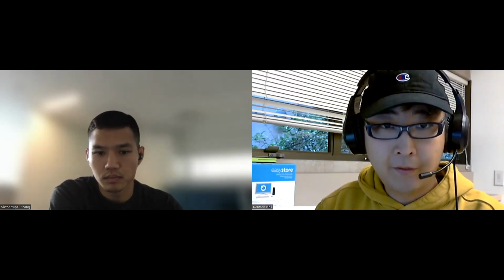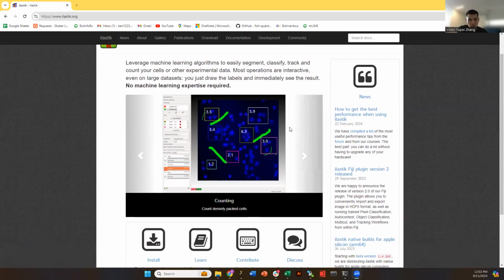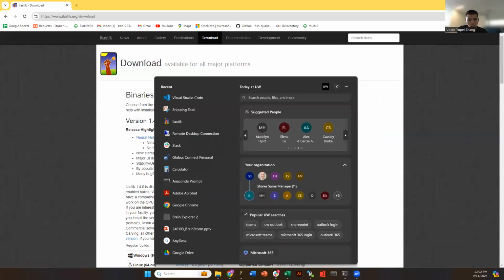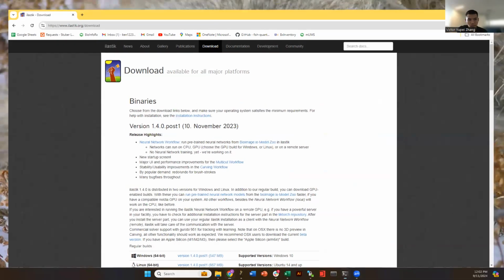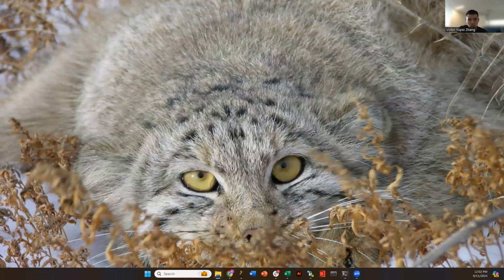Okay, I didn't share the screen. Yeah. So Ilastik, you can go to the website of Ilastik to see what it's like, and you can install and download it from these pages. When you open it, give me a second to open it. There you go.